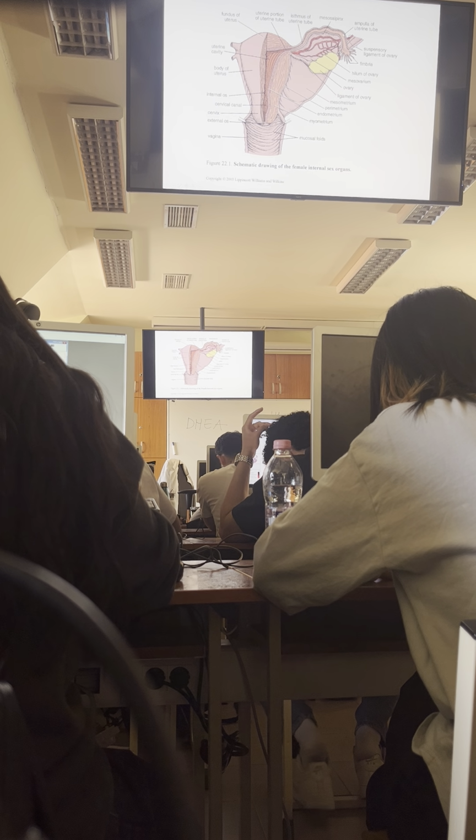This transport mechanism essentially relies on the movement of kinocilia, which are on top of the lining epithelial cells within the uterine tube, and also on the muscular components of the wall of the uterine tube, which can cause contraction of the tube.